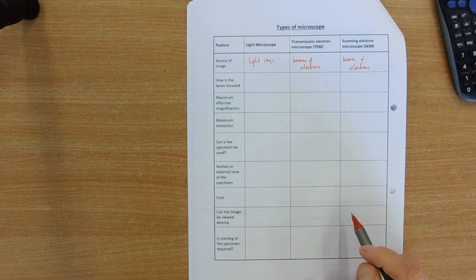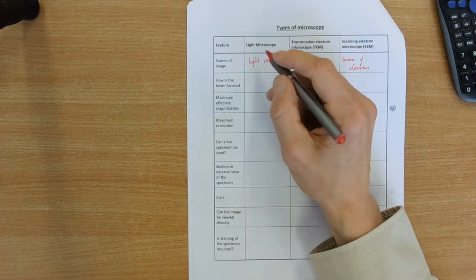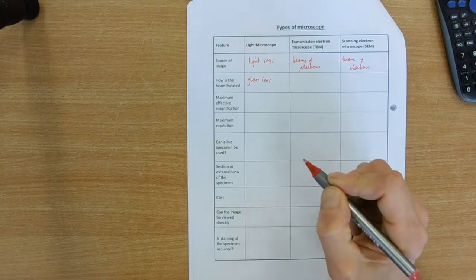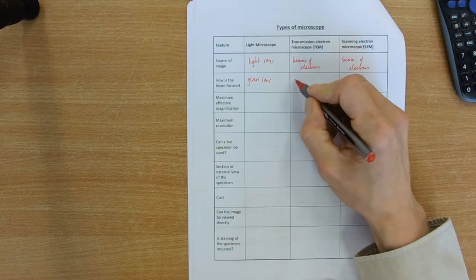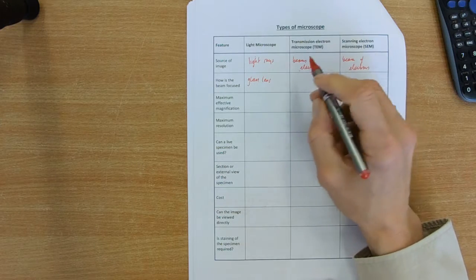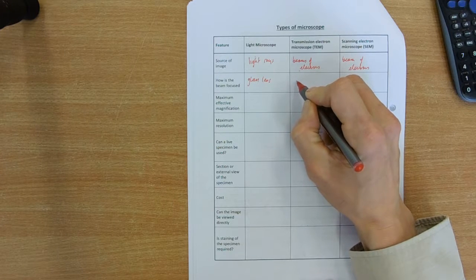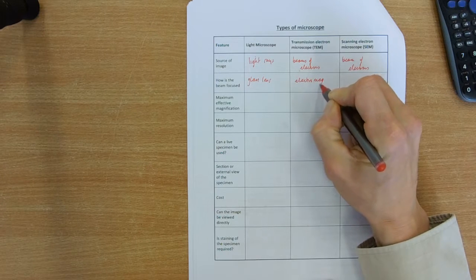How the focusing happens? Well, you've got lenses on the light microscope, a bit like your glasses. So glass lens. Whereas in these other two, they use electromagnets. You have to do that because the electrons have a charge. If you use an electromagnet, it can attract or repel a charge. So electromagnet.